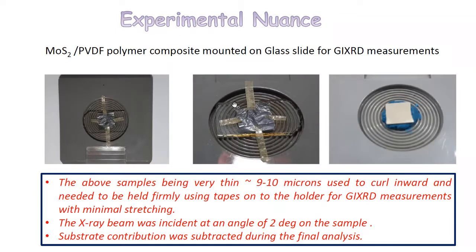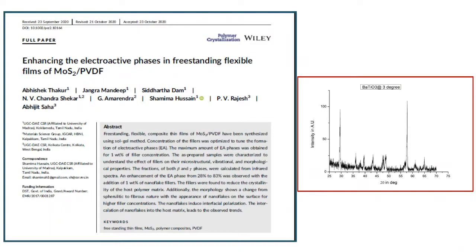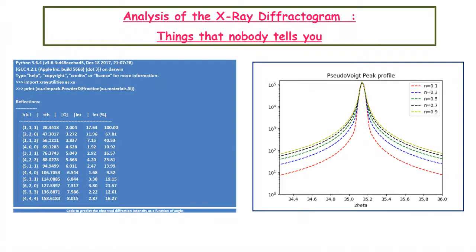As I said, we had the finesse and expertise to handle very thin films and do an experiment, and then our colleagues were able to, I'm sure Dr. Chandra Shekar may talk about this kind of work, do the XRD measurement, which was only possible because of a very delicate sample system. Now, I think a month back, my colleagues from the Bombay Center did a fantastically good talk on analysis of the XRD.